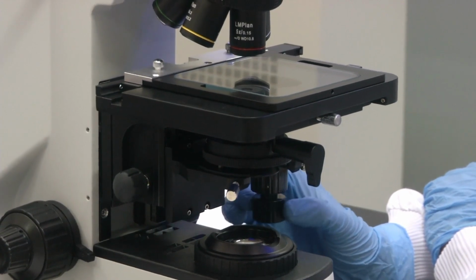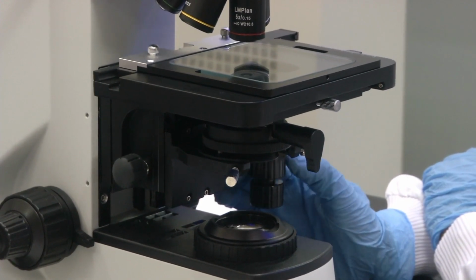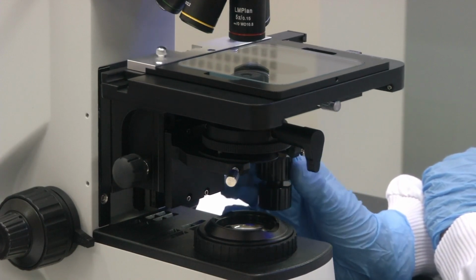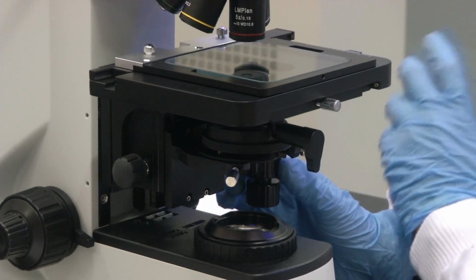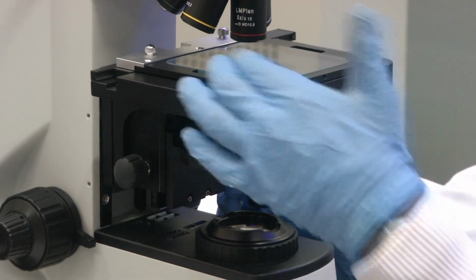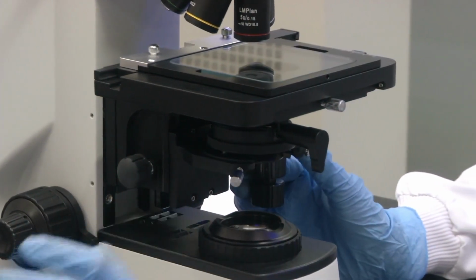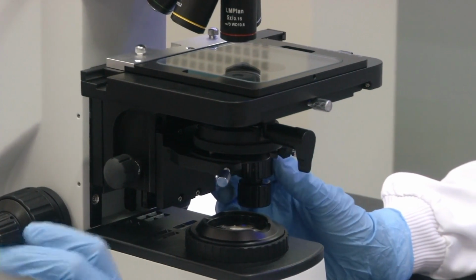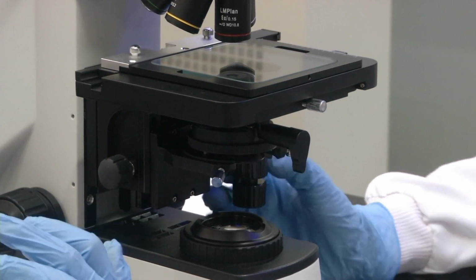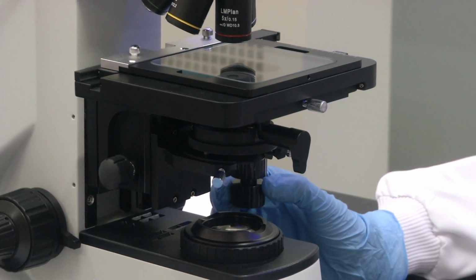Now I am adjusting the x values. So the stage is moving in x direction, and I am adjusting the y value now, and it is moving in the y direction. The illumination will be provided from bottom or top. So you cannot put your sample in the entire sample holder, because only one particular part of the sample will come under the view of your objective or eyepiece. For that matter, it is very essential that you should be given the option to move your sample around. That is how this x y staging or movement becomes useful.